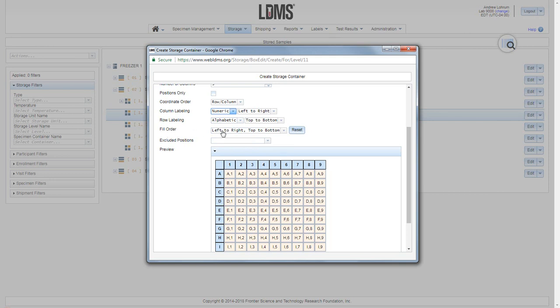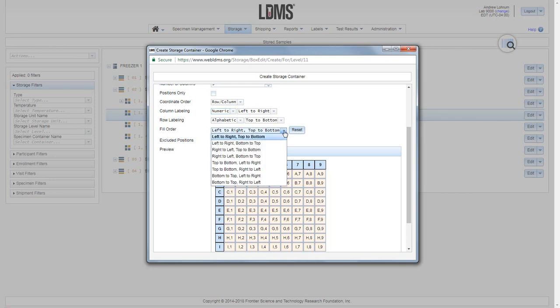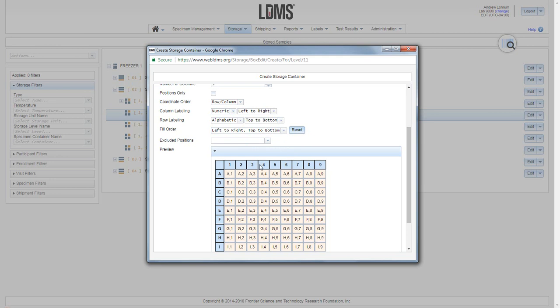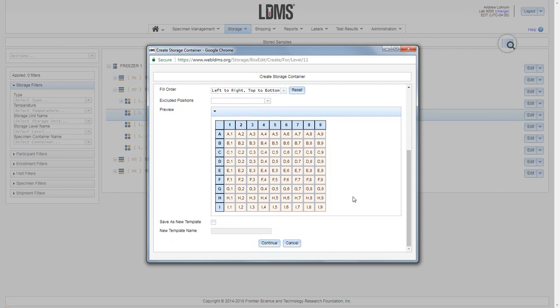My fill order is set in this drop down menu. It defaults left to right, top to bottom. All of the iterations of that are available. With that fill order in place, we see that my first space is A1 in the top left hand corner and the last space is I9 in the bottom.